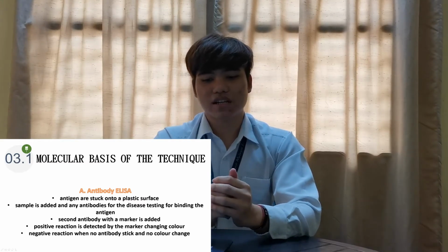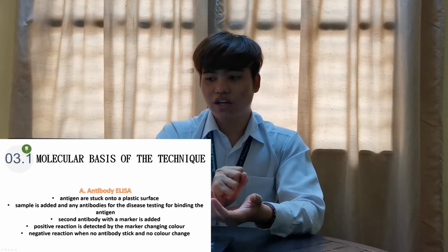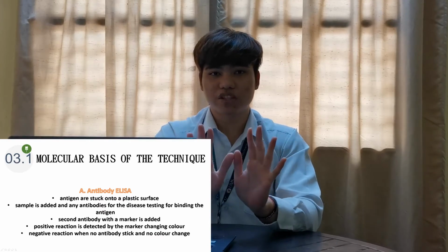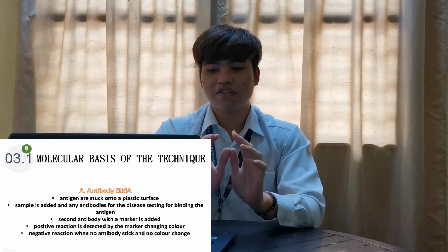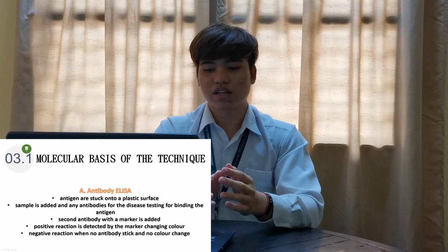Then the sample is added, and any antibodies for the disease inside the sample will be tested for binding to the antigen. If the antigen and the antibody are complementary, they will bind together. After that, the solution inside the plate will be washed out.